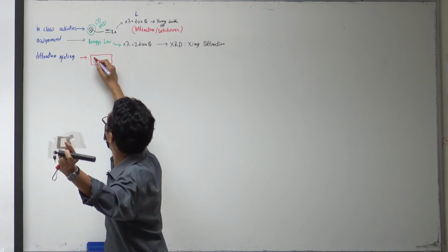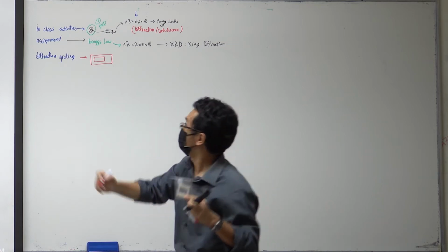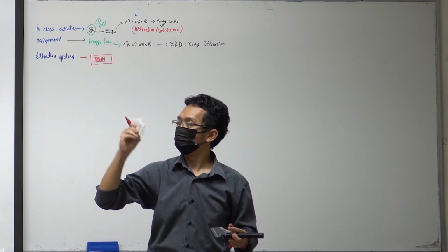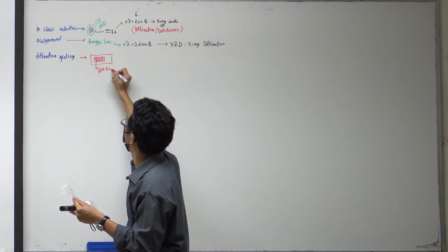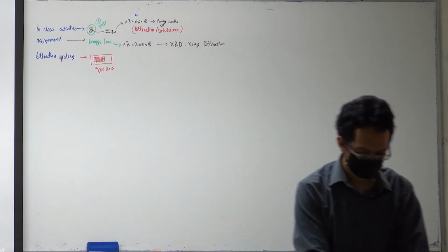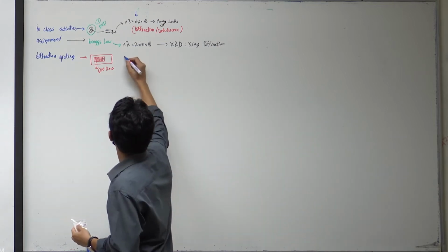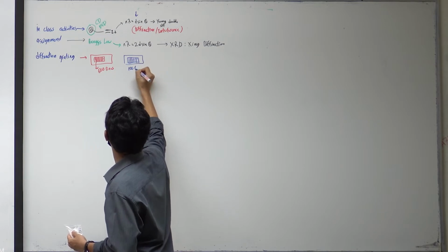inside this thing you have a window. This window is made of plastic. Inside this plastic, there are lines. On my right, you have 600 lines. And on my left, it's hard to hold so many things. On my left, you have how much here? There are only hundreds. So imagine you have two diffraction gratings, and now you have this one with 100 lines.